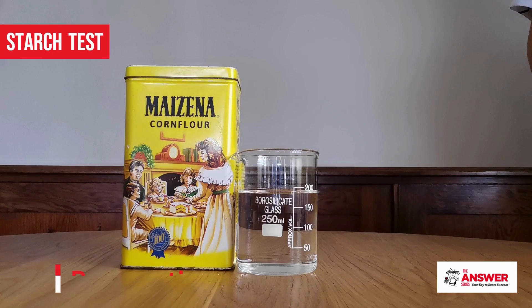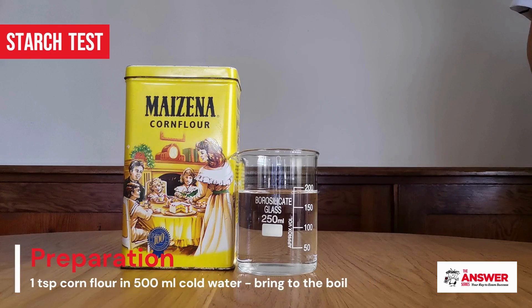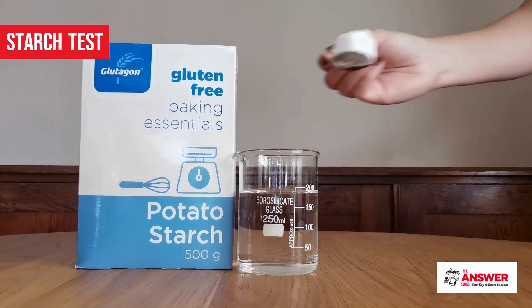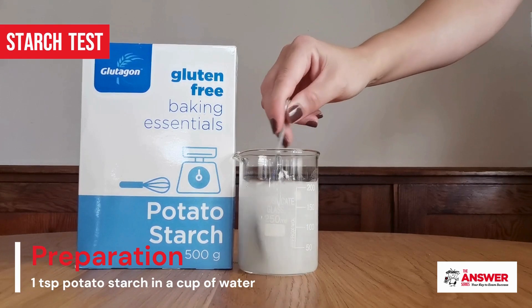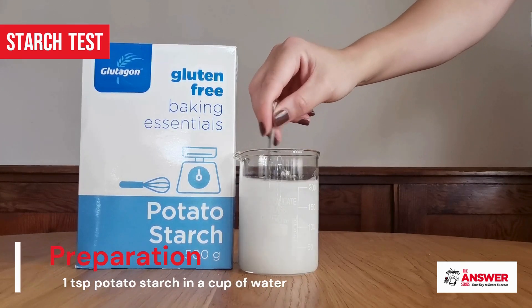If you opt for the corn flour, mix one teaspoon into 500 milliliters of cold water in a pot and bring that to the boil. If you are using the potato starch, prepare it by dissolving one teaspoon in a cup of cold or lukewarm water.